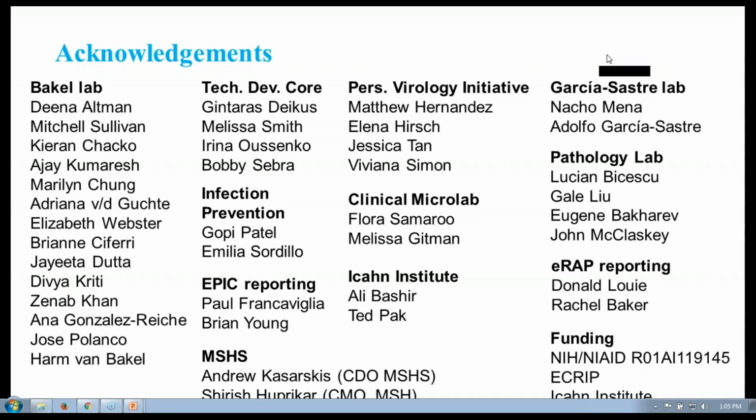Okay, and this one back to you, Ben. What are other criteria apart from circularity do you have to verify the assembly outcome? That's a tricky question. I think that's kind of a hard thing to assess. There's a number of tools out there, obviously, so you can use BUSCO analysis to look at the content of the genes in your assembly and check that against a database of expected genes.